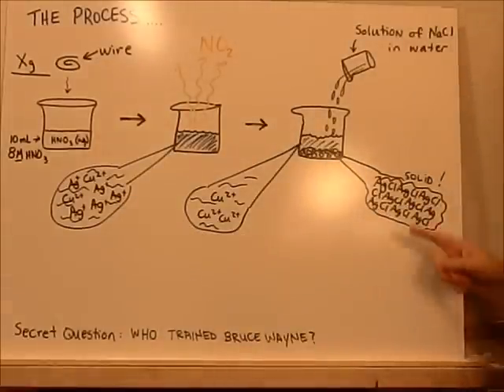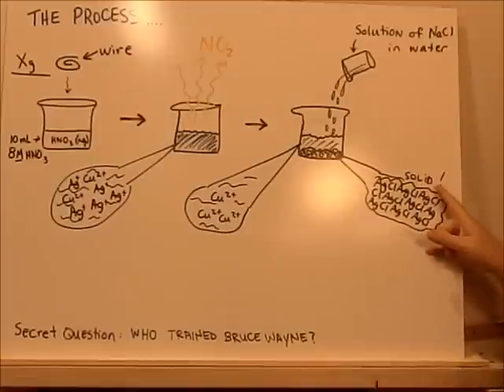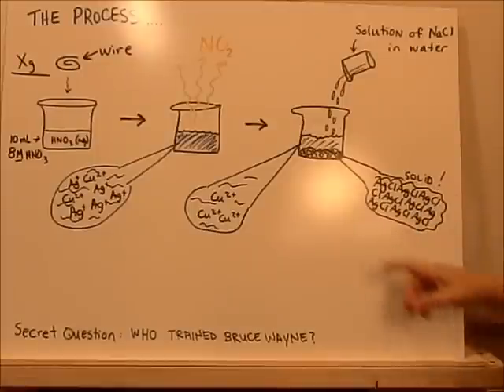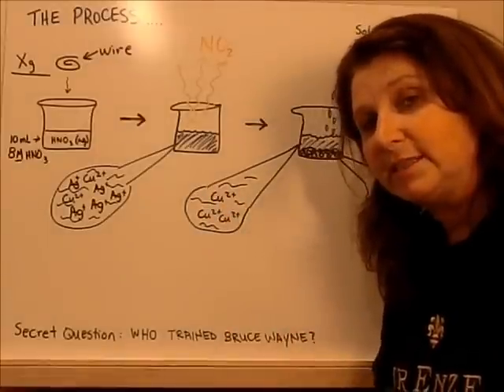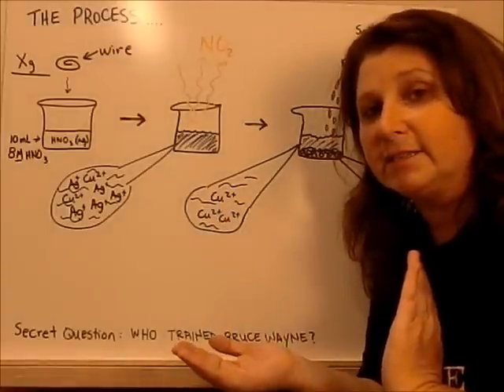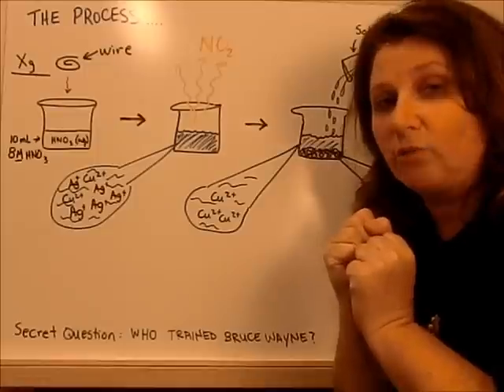And what you end up with is AgCl. It's a salt. It's a solid compound of a 1-to-1 ratio of silver to chloride. It's a solid. And what's left swimming in the water is just plain copper ions. So you've separated the ions, and then you went and grabbed out the silver with the chloride in a 1-to-1 mole ratio.